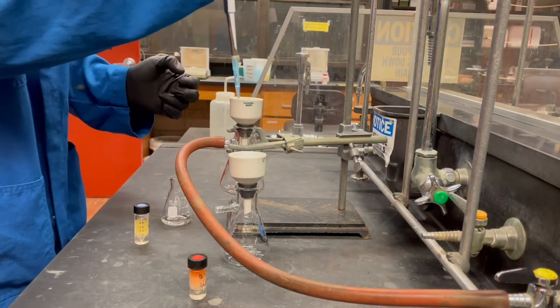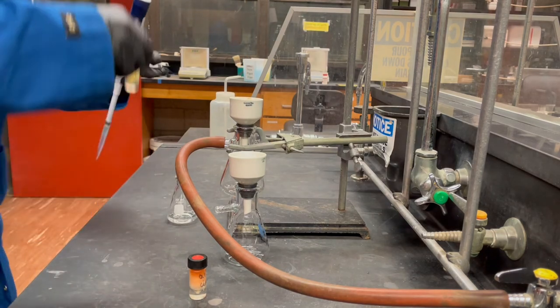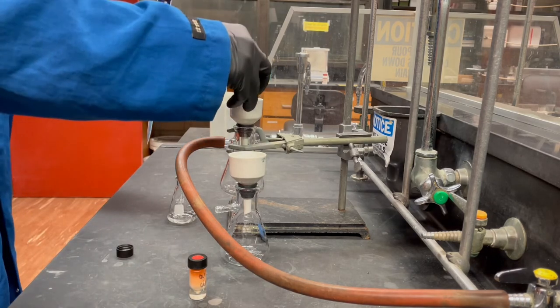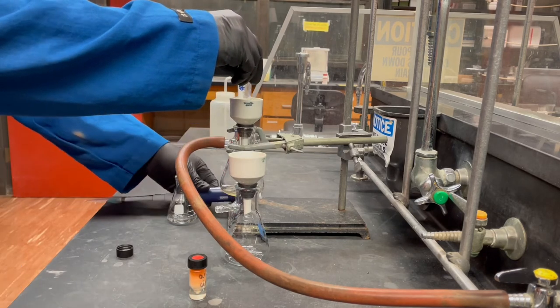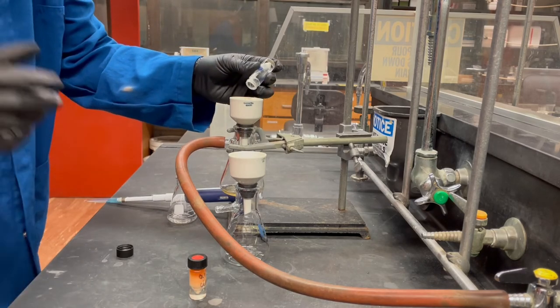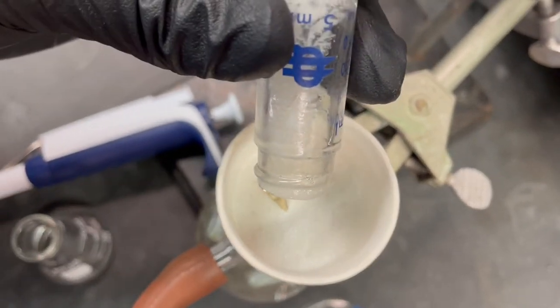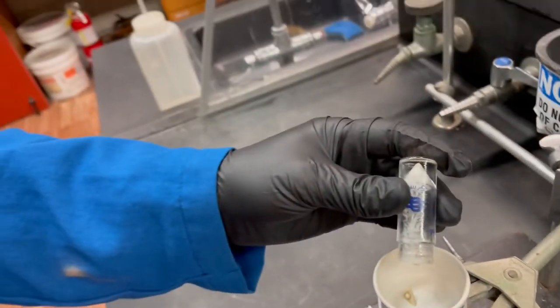A little bit of ethanol to moisten that. I'm going to see if I can get this swirled and poured off. I see some solid material in here for sure, so that's awesome. Look at this. You can see a little solid in the little conical vial, and in there as well. So we're good to go.